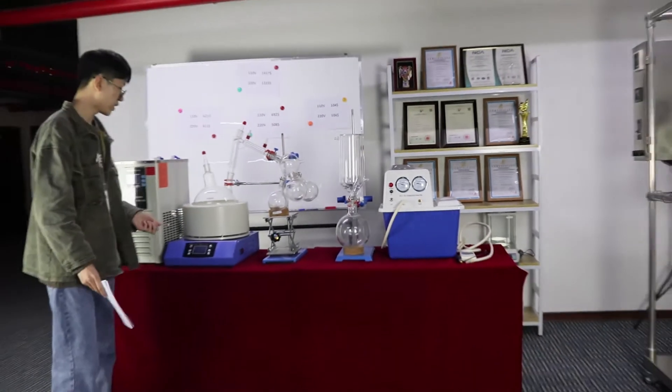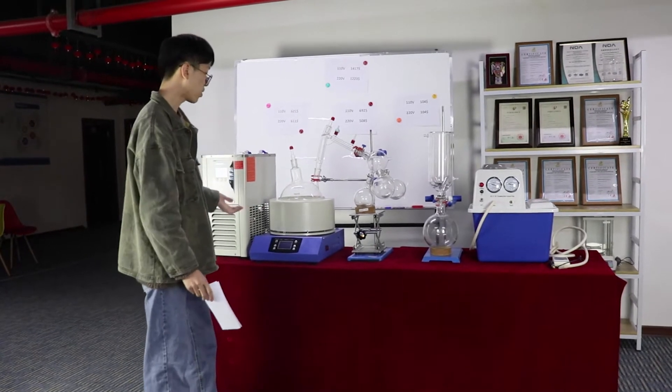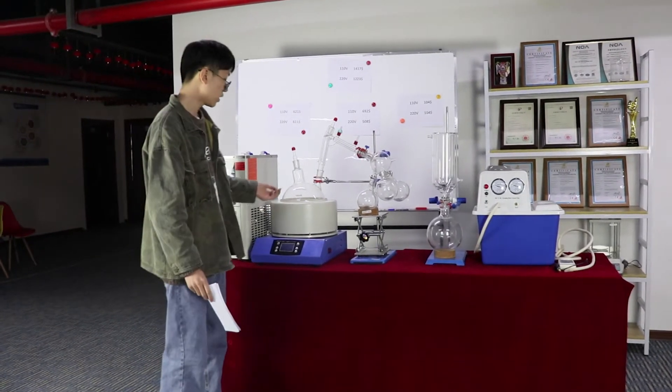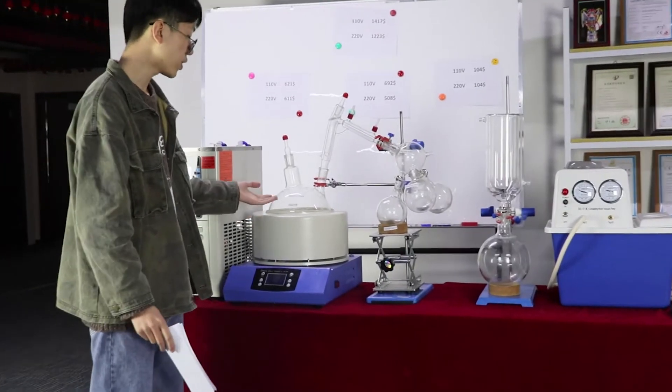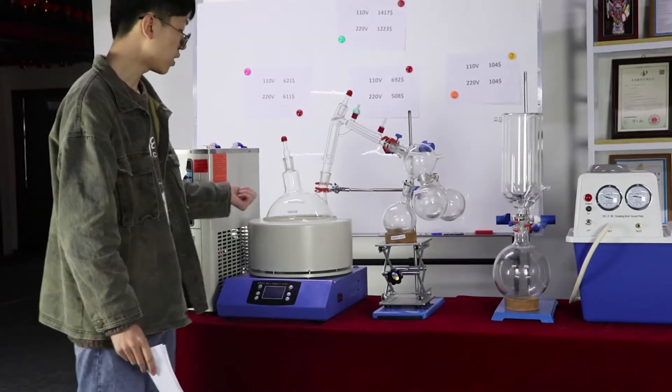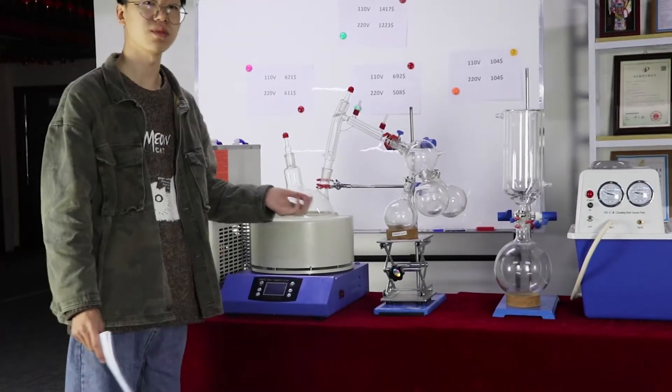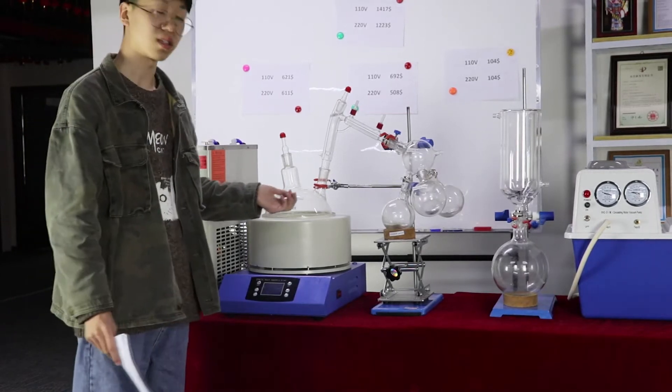Okay, first, let me show the short path distillation. This is my component, the evaporator bottle and magneton. The magneton is in the evaporator bottle. It can store the material.